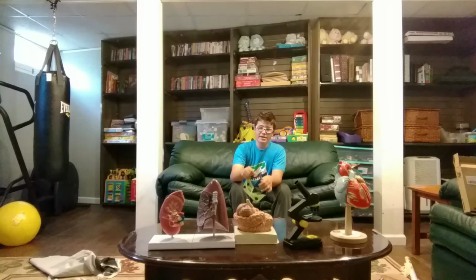One of the most common tools a scientist needs to have is his goggles. These are used to protect his eyes in the occasion that chemicals can get into your eyes. We don't want that happening, otherwise you can get severe eye damage and your lab might not really go as planned. Let's go make sure our students have their goggles on.